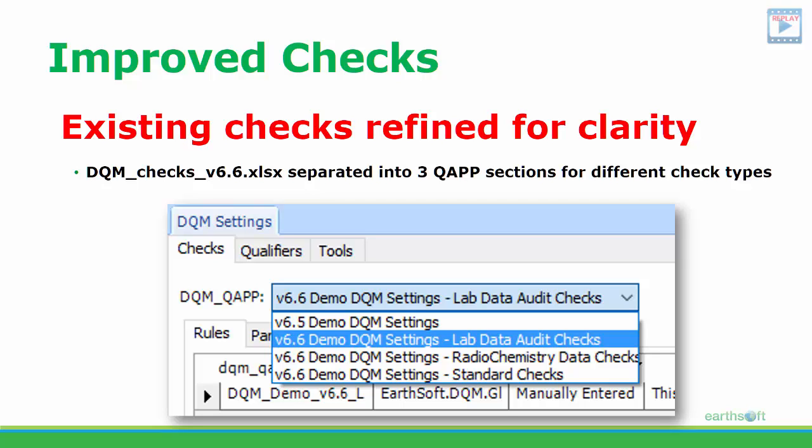Yeah, and I'm thinking, from the laboratory perspective, to make it easy for them to provide some kind of minimal deliverable, not the full-blown one, just a reduced set, like method blanks and the samples, and shoot that over. So do a very minimal but important check.